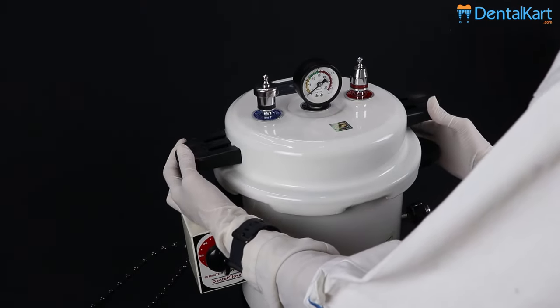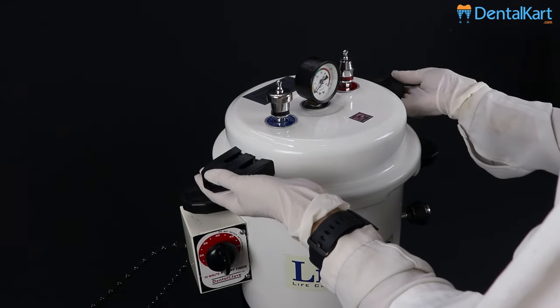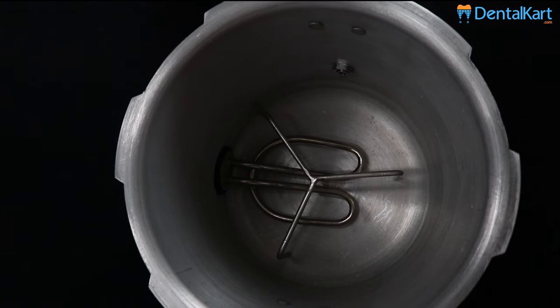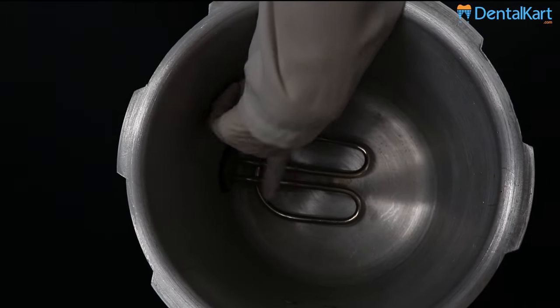To open the autoclave, turn the lid anti-clockwise. As you feel the unlock, lift the lid up. This is the stainless steel drum. Inside the autoclave, there is a stand for the stainless steel drum and the heating element.